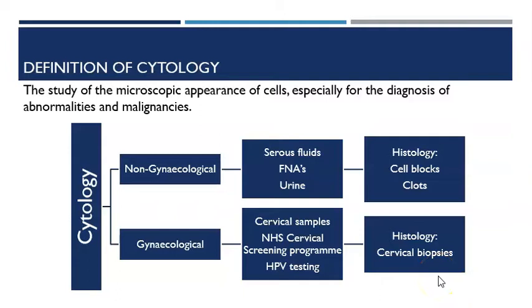and I will cover cervical biopsies in the second half of this lecture. For non-gynecological cytology, we're looking at things like urine or sedimented urine, fine needle aspirate biopsies, or just fine needle aspirates, and we'll look at the difference between those later on, and serous fluids, so fluids, things like peritoneal fluid, that type of thing, and I'll cover that later on.